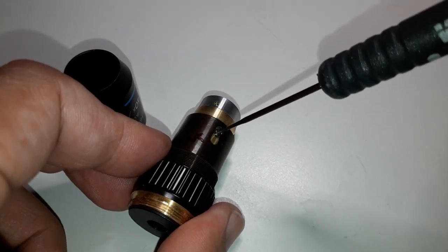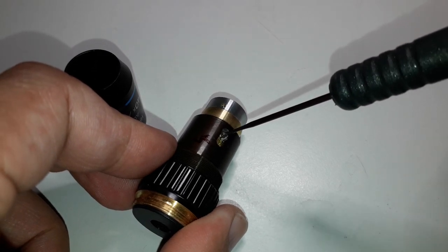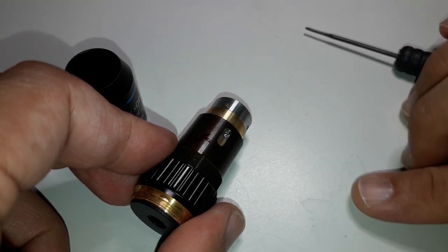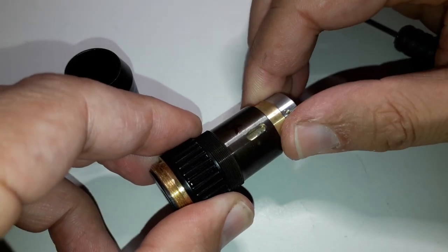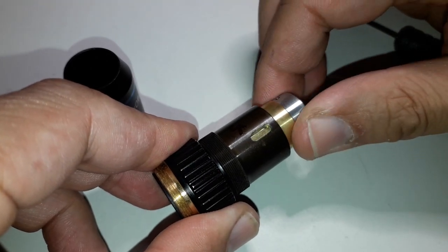I found out that removing the screw really did not help at all in taking the objective apart. The screw was only there to prevent the front part from rotating. Nothing really changed. There were several holes in the barrel — I don't know why they've done that.